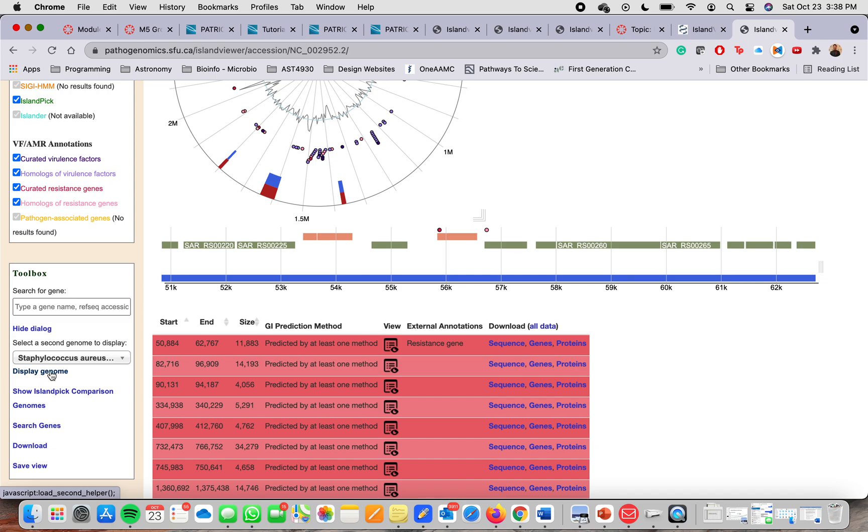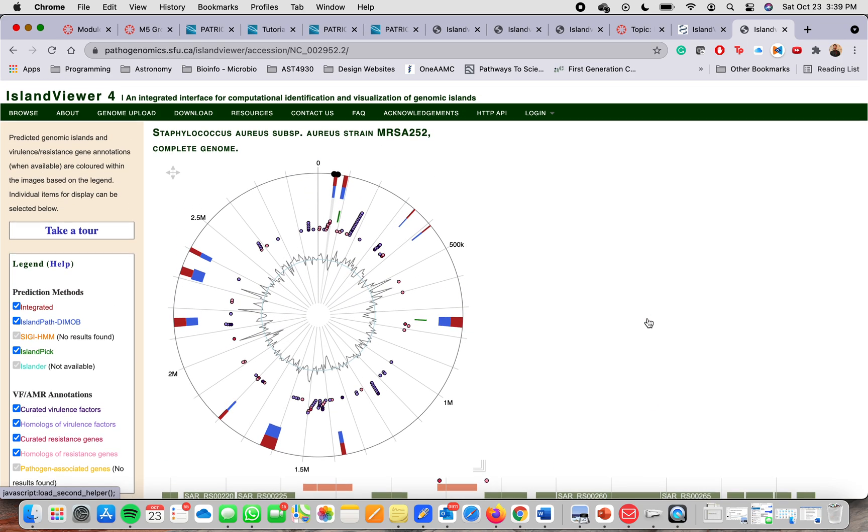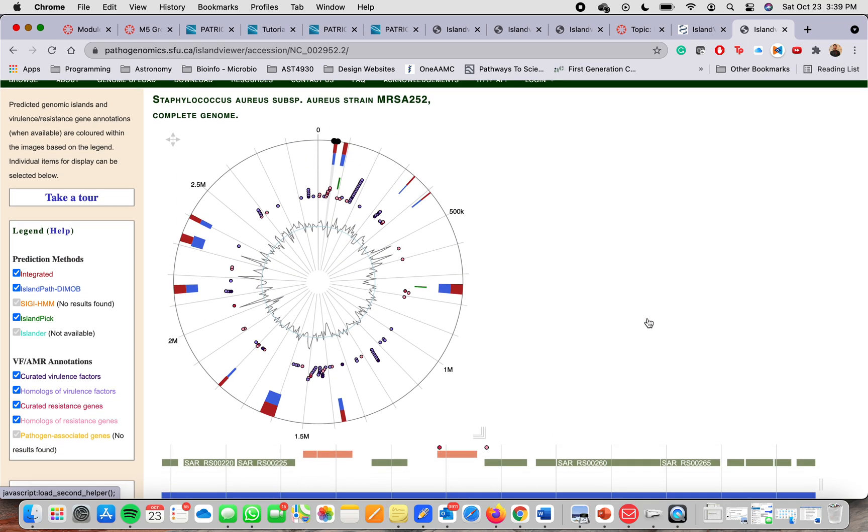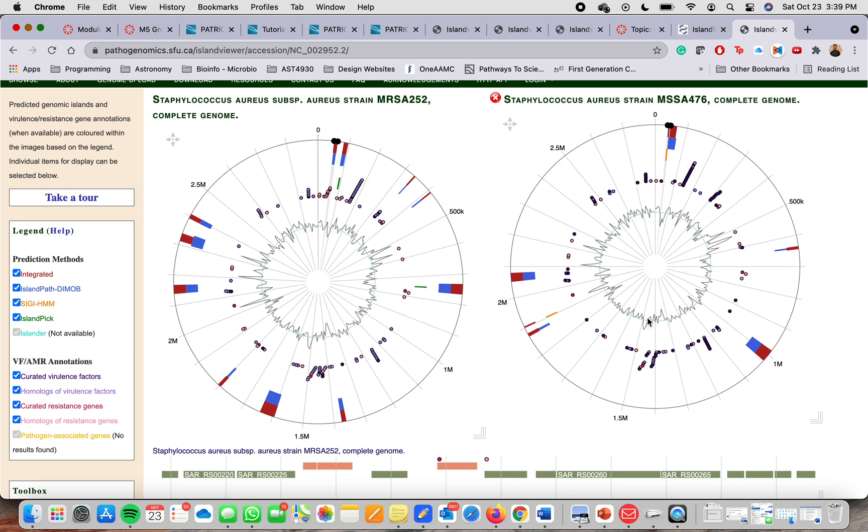And this may take a few seconds. You should be able to see two visuals of the two genomes. There you go. Now we have the two visuals. On the left, we have the first genome that we looked up and on the right, the new genome.